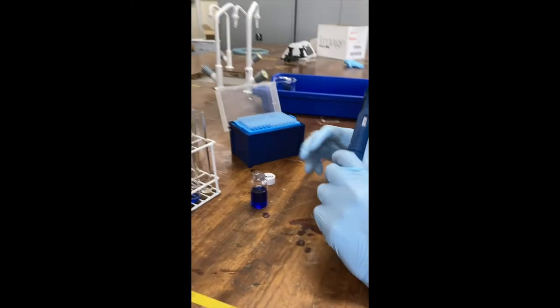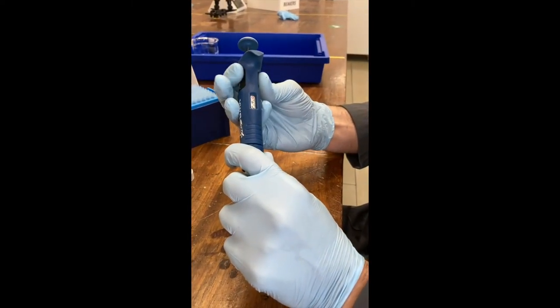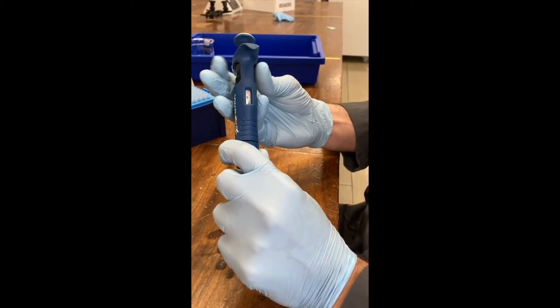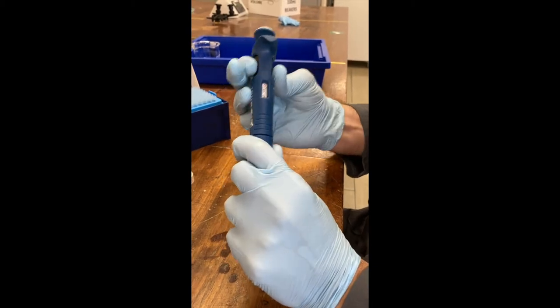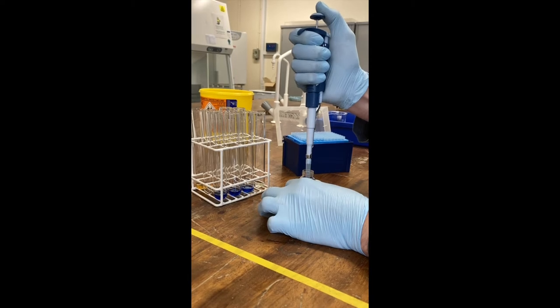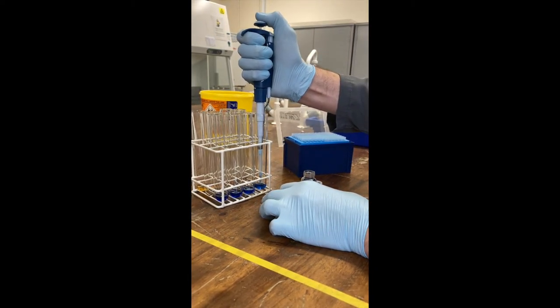Now for the final one, I have one and a half mils of water. So I'm going to go down to 500 on the pipette. Make sure you lock it. Put that up and down a couple of times.